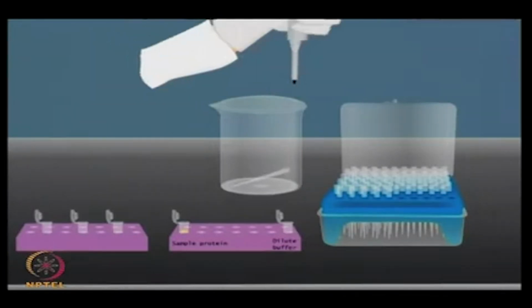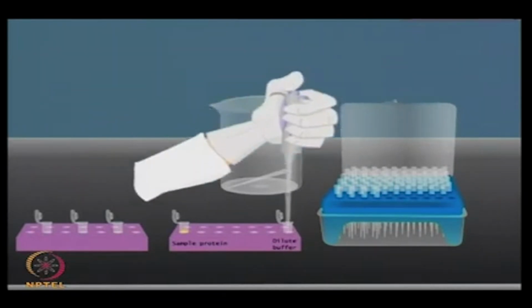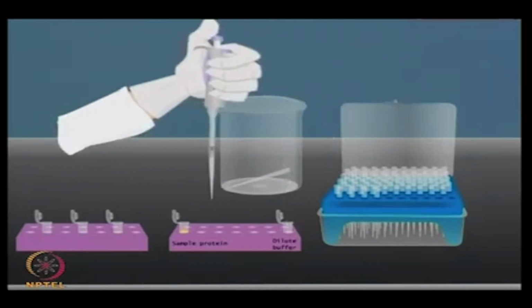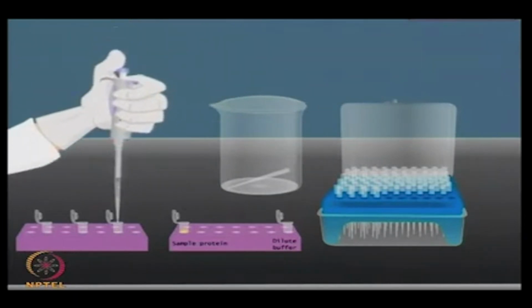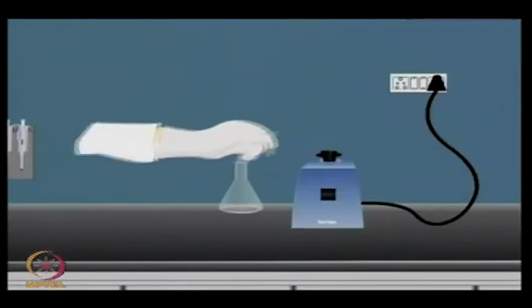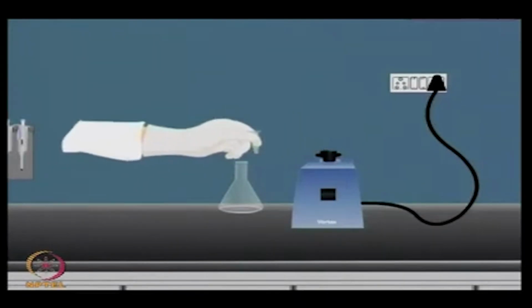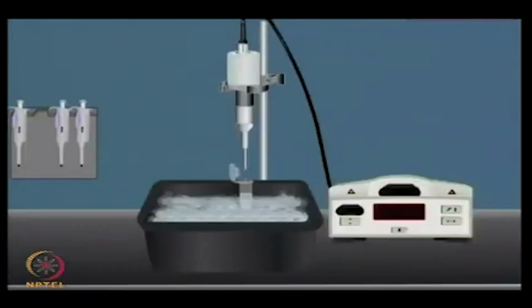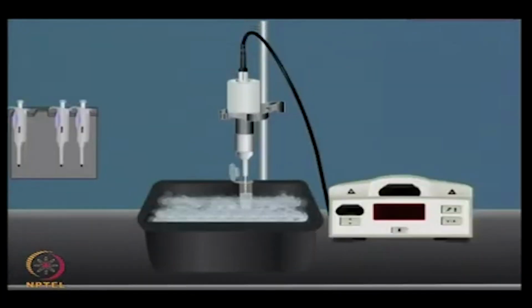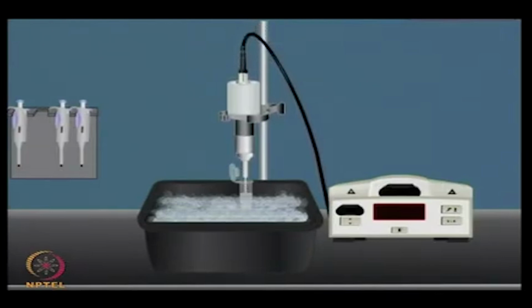Sonicate the serum to break down any large protein complexes. Serum contains several proteins in a wide range of concentrations, of which albumin and immunoglobulin G are the most abundant ones. The presence of such high abundance proteins can interfere with the experiment. Therefore, we need to remove these high abundant proteins. So, in this experiment we tried both sonication and depletion of the high abundant proteins.